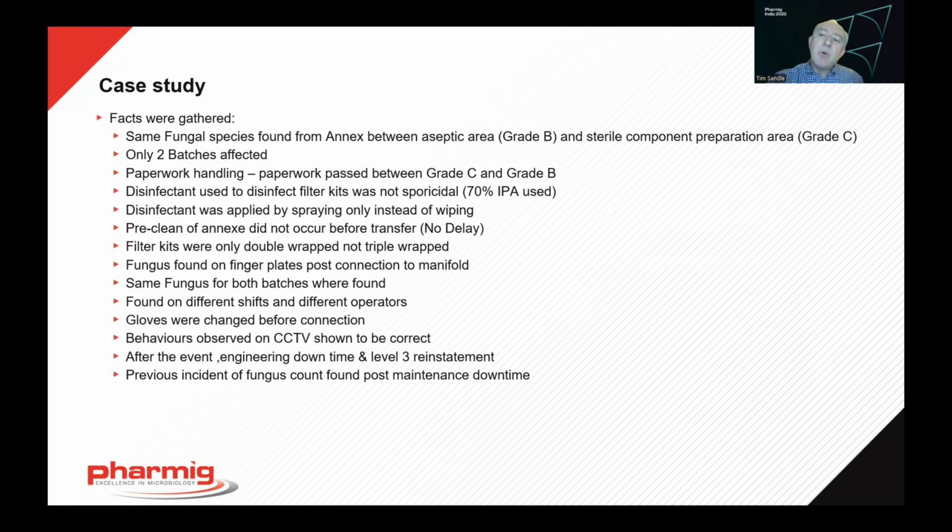And here it's important to be non-judgmental. But one of the things that stood out was that these items were only double wrapped, and there were more than 2 key transfer steps. So, is there insufficient wrapping and then insufficient opportunity to perform decontamination at the appropriate juncture?